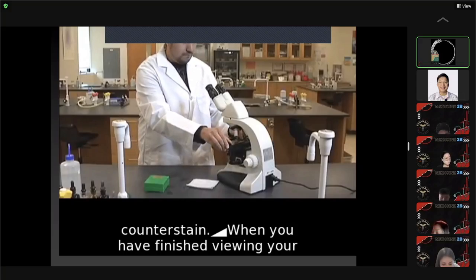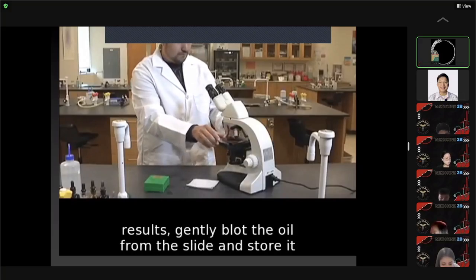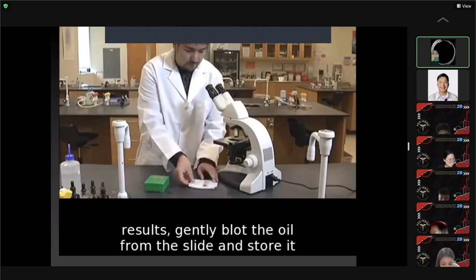When you have finished viewing your results, gently blot the oil from the slide and store it in a slide box.